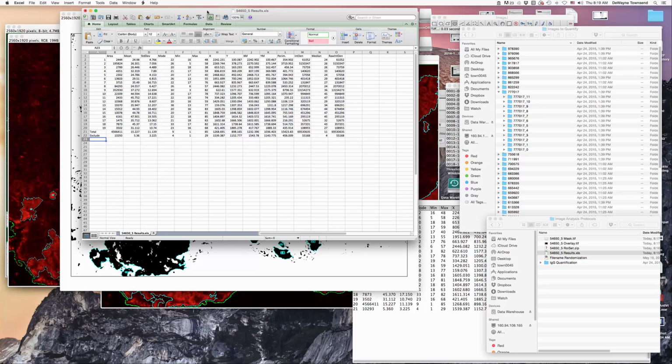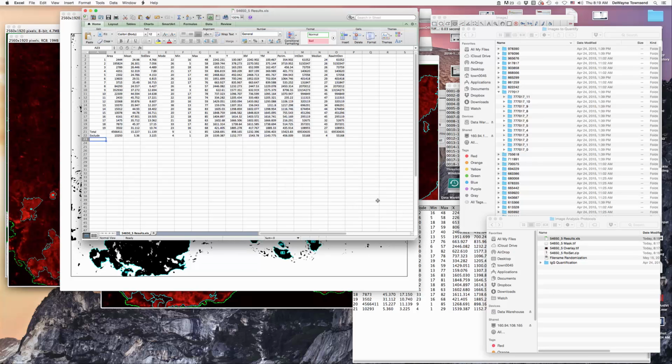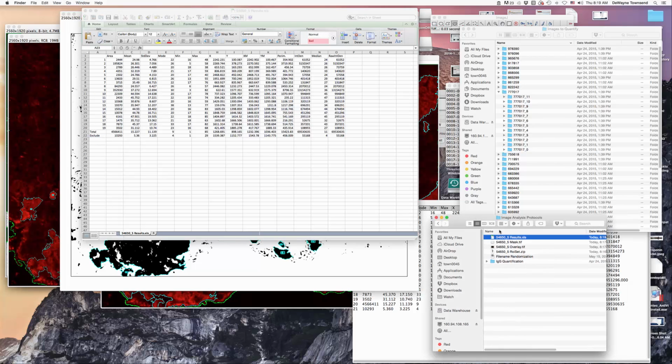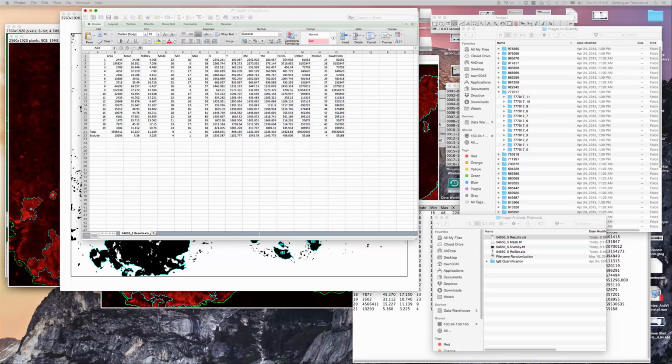Okay, so then you want to save this, and you just continue. You can see that it updated quite nicely. All right, so that's the gist of it. There's not a lot more to worry about. So, all right, thank you very much.